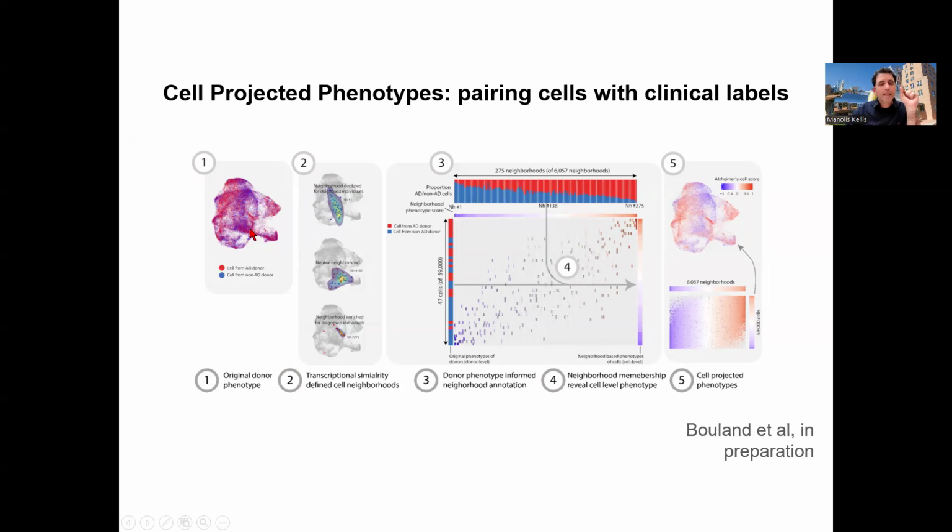What does that mean? That means that I'm not going to look at discrete cell types anymore. I'm not just going to simply cut here and say all of that is excitatory layer 5 or 6, okay? Instead, I'm going to say within astrocytes, I'm going to study the neighborhood of every cell, the transcriptional neighborhood of every cell. This is not spatial neighborhoods. This is transcriptional neighborhoods. This is not XY coordinates of a two-dimensional plane that I'm looking at the cells. This is some lower dimensional projection of the transcriptional similarity between cells. So the proximity of those cells reflects how close are they transcriptionally. Everybody with me here?